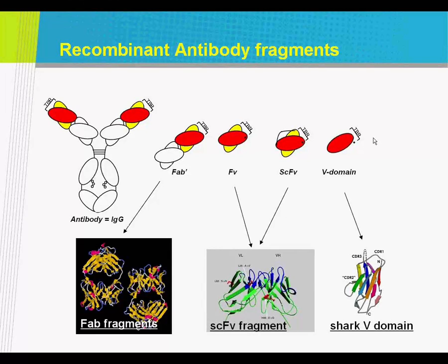That process is quite long, and no matter what assay you're using to pre-screen these fragments so you can narrow down, it takes a long time to get a full kinetic analysis of your candidate binders. So we were always keen to develop some sort of assay where we could very easily analyze our candidate binders.